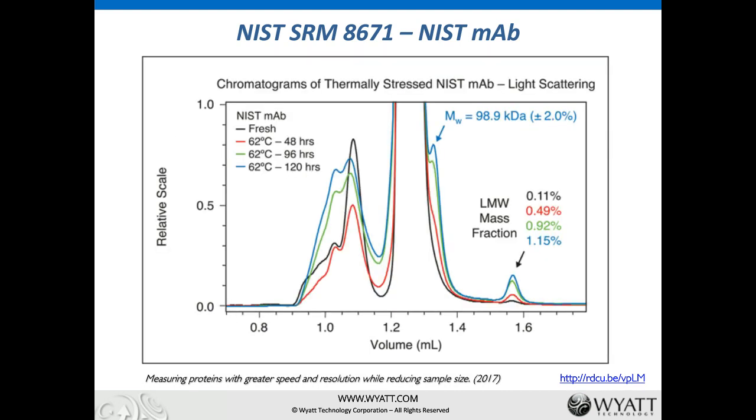One last slide about the NIST map. Since µSEC-MALS has the advantage of fast and high-resolution analysis, it can be used effectively as a tool to monitor degradation after the sample has been exposed to various stressors.